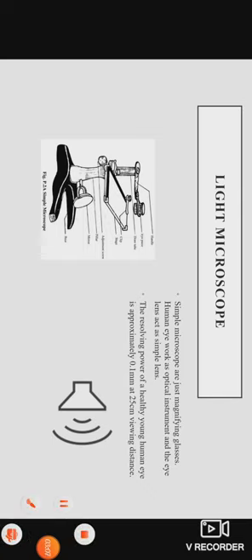That's why whenever you have to read your books, maintain the distance at least 25 centimeter from the eyes to books. Any object smaller than this cannot be viewed by naked eye. A microscope is therefore used for magnifying the smaller objects so that they become visible.